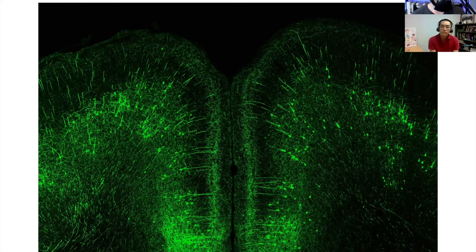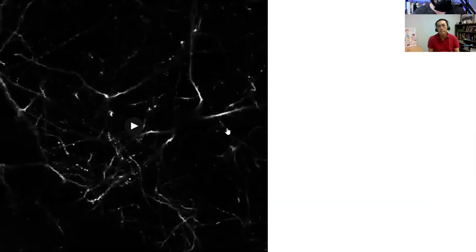Yeah. And for those listening, these images are actually very pleasant to look at. If you had no idea what you were looking at, you might just think it was an interesting photograph or piece of art, but it's actually the brain of a mouse, which is pretty cool. So this is still a fairly zoomed out image compared to some of the experiments you do. And this is also a slice from a mouse that is no longer living. But of course, you have this remarkable ability to use two-photon microscopes to actually look inside the brain of a living mouse. And I believe we have a short video of what that starts to look like. So I'm going to play this a few times. Can you just describe what we're seeing here?